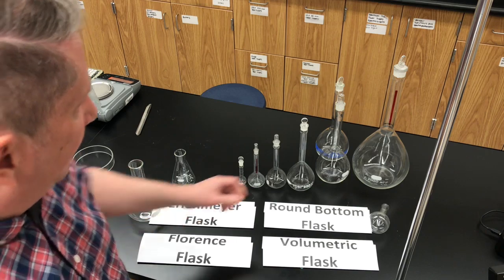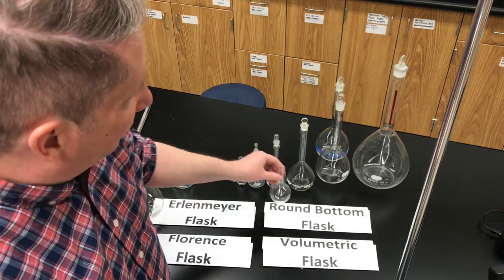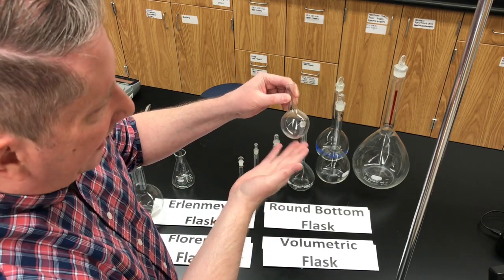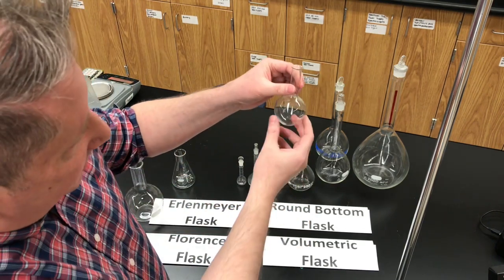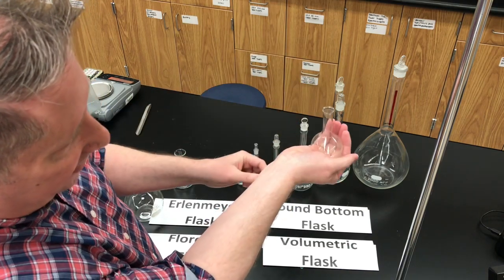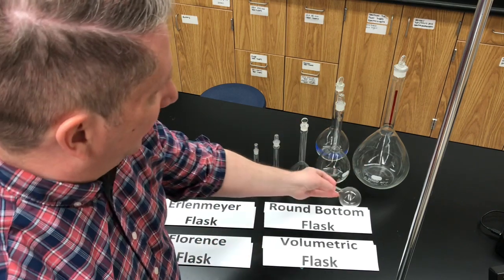A third type of flask, very similar to the Florence flask, is the round bottom flask. It has the same sort of round base, but there's no flat bottom to it, so it can't sit on its own on the desktop — it'll fall over. It's designed to sit in a small heating mantle and be heated in an organic chemistry experiment. That's a round bottom flask.